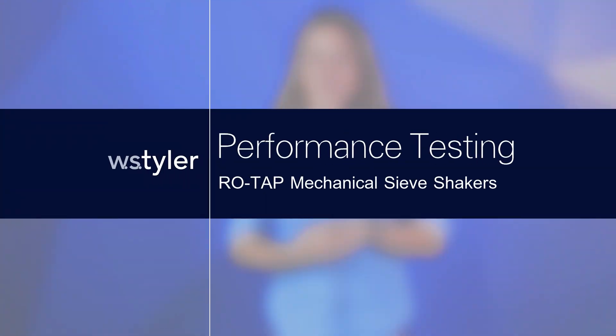Are you wondering if your Rotap isn't performing as well as it could, and if so, what do you do about it? Don't worry, I'll explain everything you need to know so stick around. Hi there, I'm Candace and I'm the product manager for particle analysis at WS Tyler.